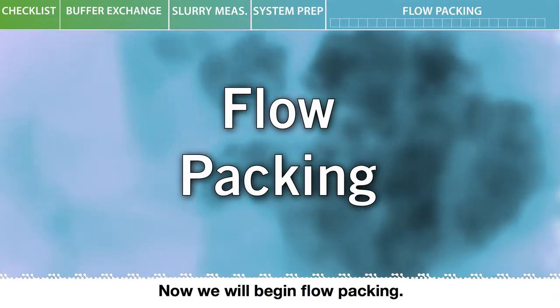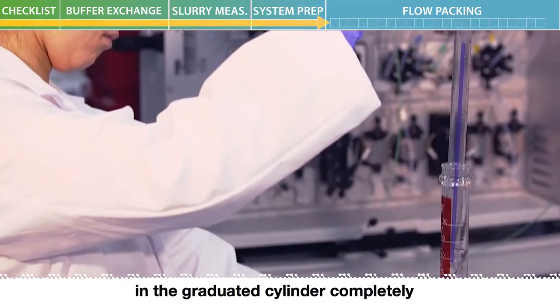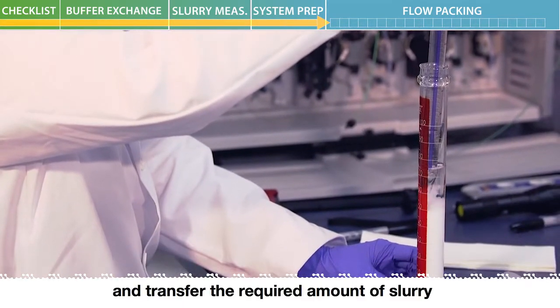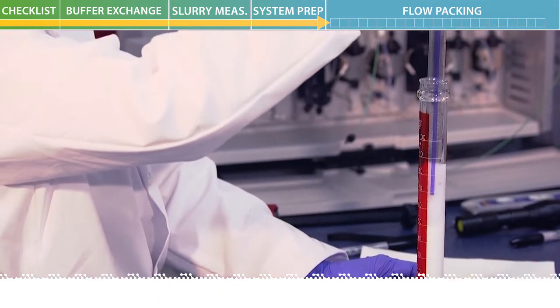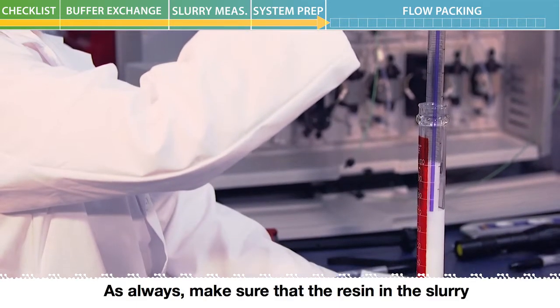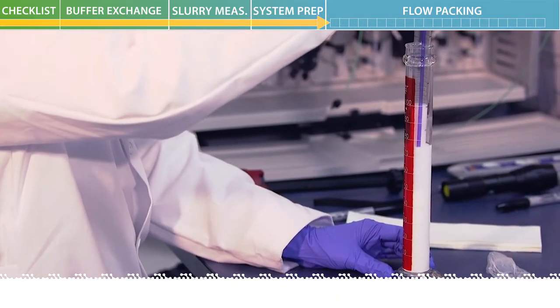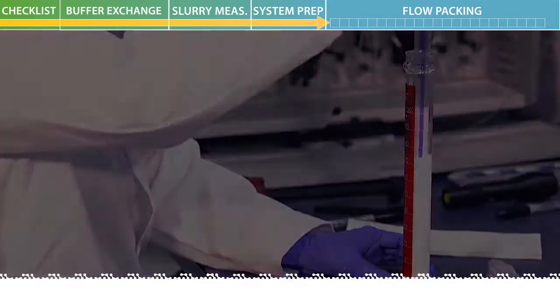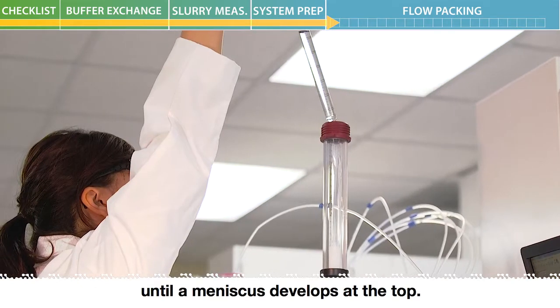Now we will begin flow packing. Start by dispersing the resin in the graduated cylinder completely and transfer the required amount of slurry with an electronic pipette. As always, make sure that the resin in the slurry is completely dispersed. Next, top up the packing tube with sodium chloride solution until a meniscus develops at the top.